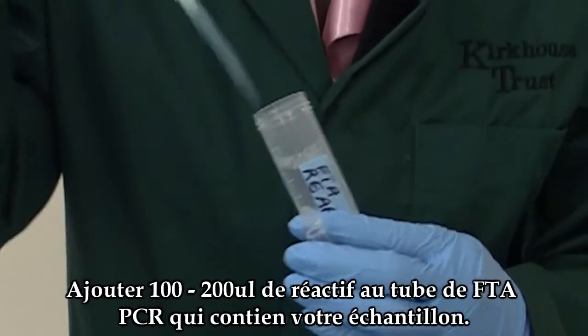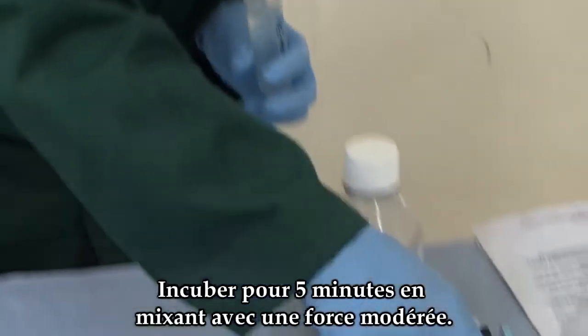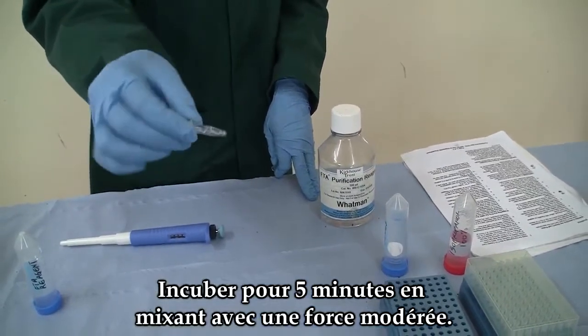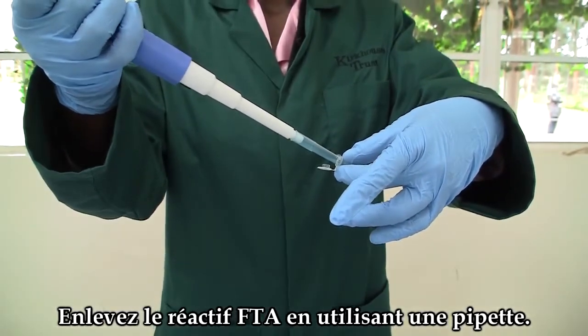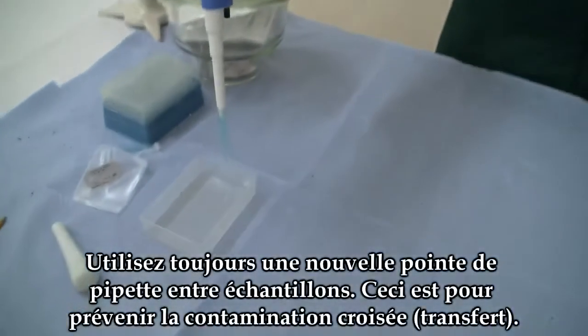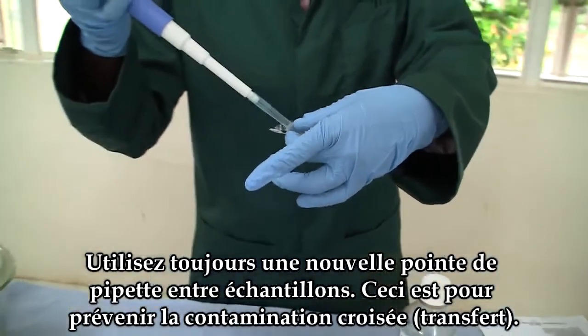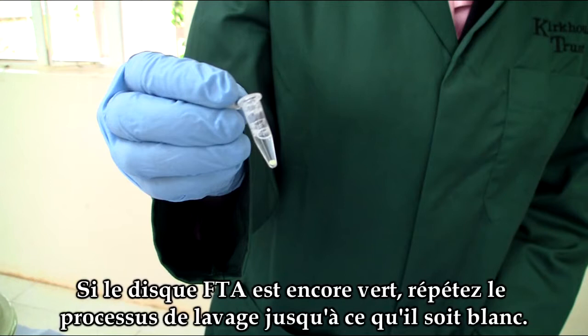Add 200 microlitres of FTA purification reagent to the PCR tubes. Incubate for five minutes with moderate manual mixing. Remove the FTA reagent using a pipette — note that the FTA reagent has a lot of foam. Ensure that you avoid any cross-contamination between samples when using the same pipette. At this stage, the FTA disc should be white and no chlorophyll should be visible. If it is still very green, repeat the washing steps using FTA reagent.